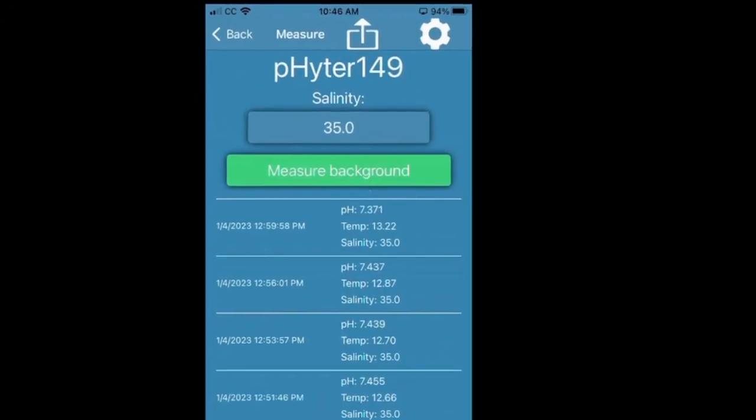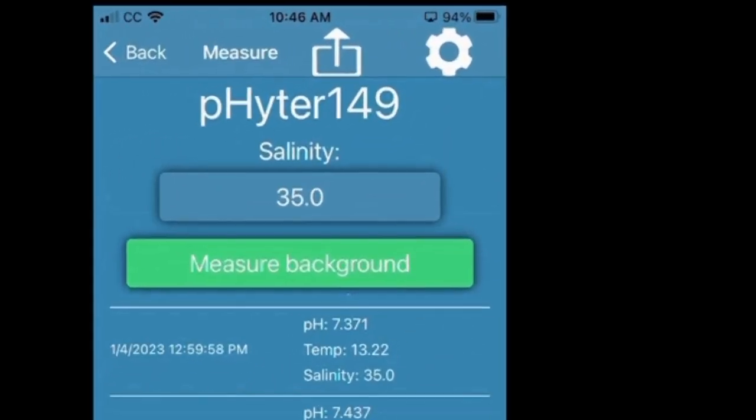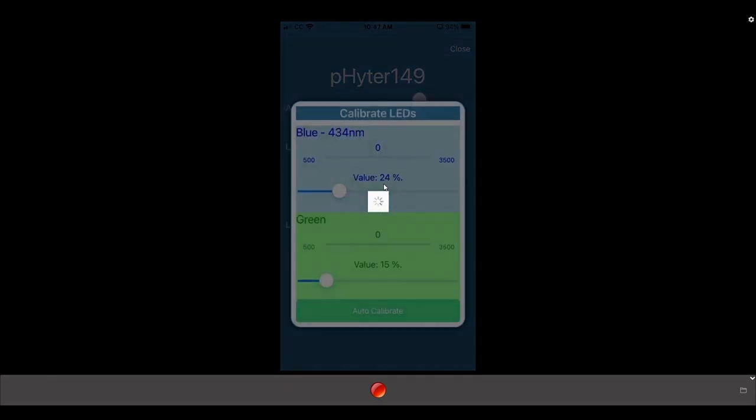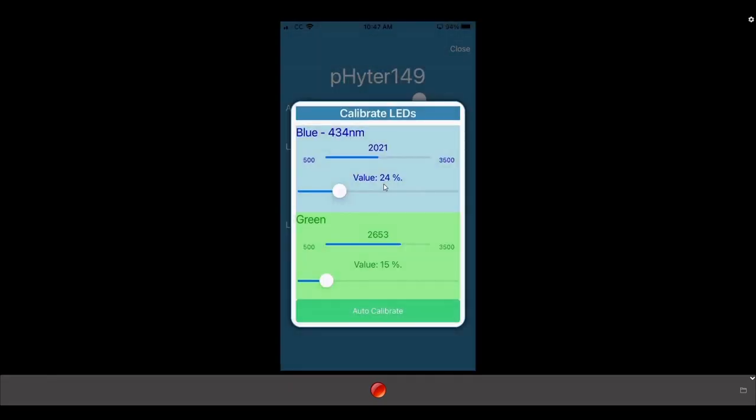When you first use your Phyta, you will need to calibrate by pressing the settings button and then calibrate, and you need to adjust these sliders to give a value somewhere between 1000 and 3500. With water in the sample, both of these are in the 2000s, so that's an ideal range.